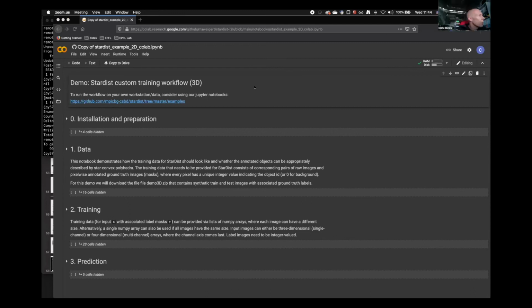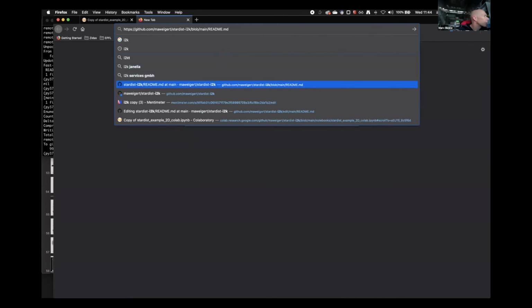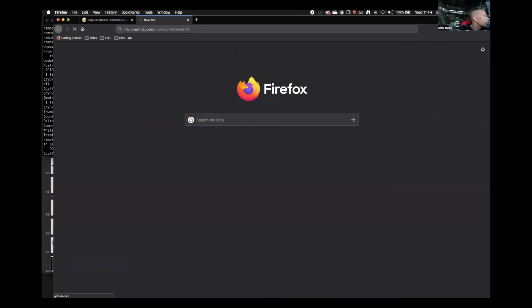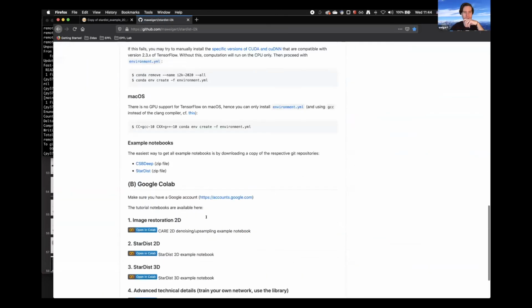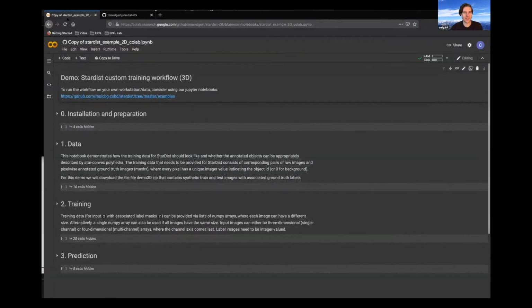I don't yet for the moment. Okay. So it's on the bottom of our GitHub repo. Here, open in Colab. And you have to sign into your Google account for that. I'm good. Okay. Everyone else good? Okay, good. So I'll make that full size.